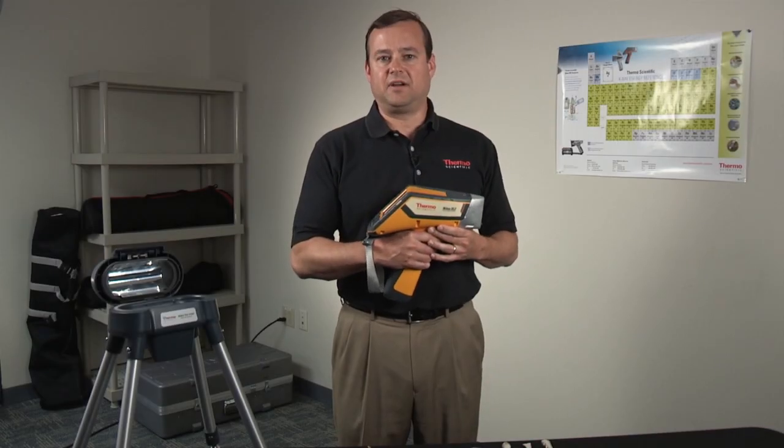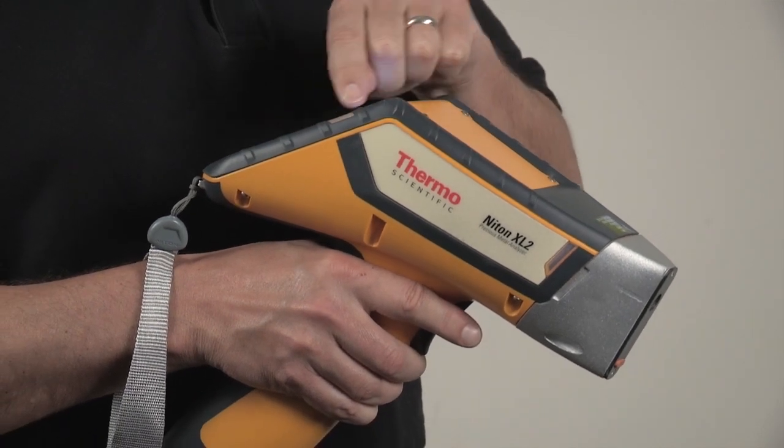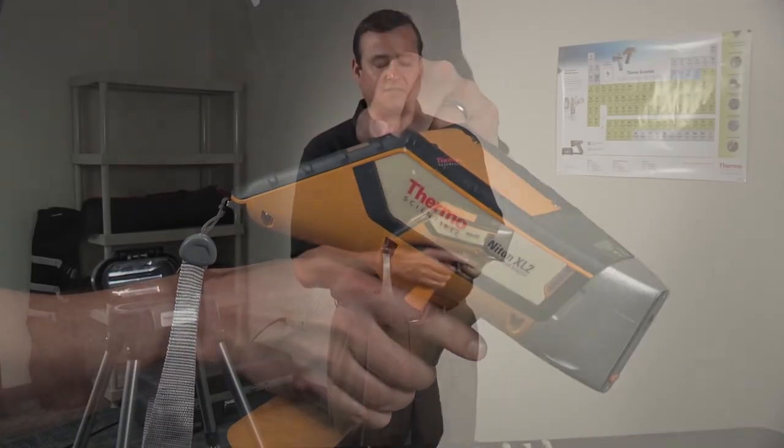The analyzer itself is actually very easy to use. You simply turn it on, log on, and on the touch screen display you hit analyze and you're ready to go.